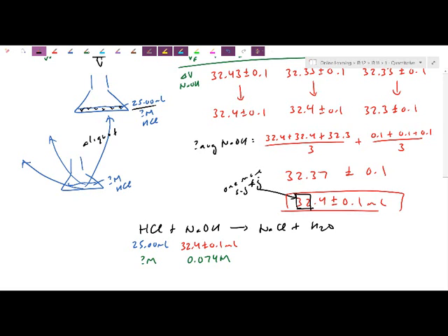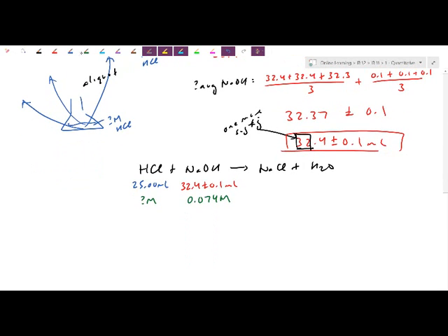Here's another hint. Especially when you're dropping in base, the total volume actually does change, but you notice that in none of these experiments did I actually care about the final volume. It was just sort of unfortunate that when I drop in base particles to kill off the acid, it just added up the total volume. It would look like it dilutes, but ultimately, when you have a good count of how many moles of acid particles there are present, eventually that acid was just in 25. I'm always going to be dividing by the initial volume. So let's see how this works out.